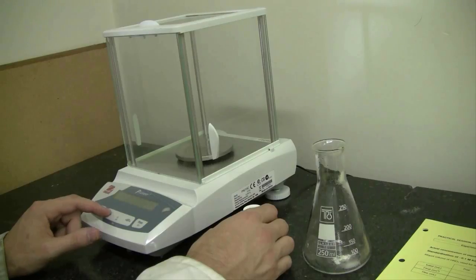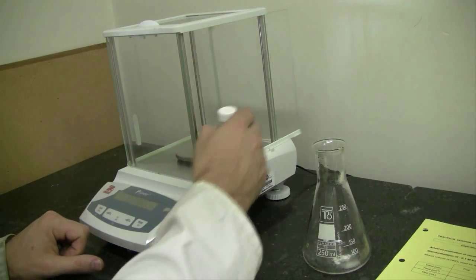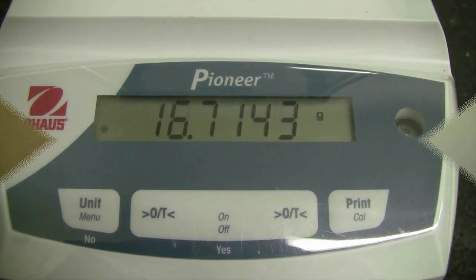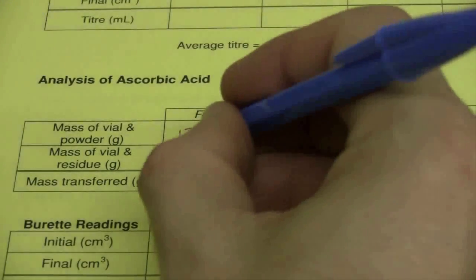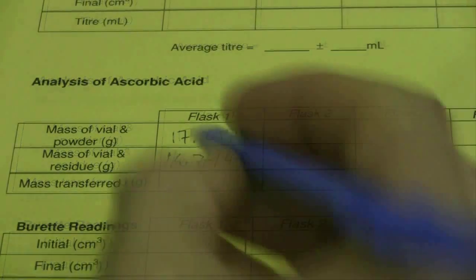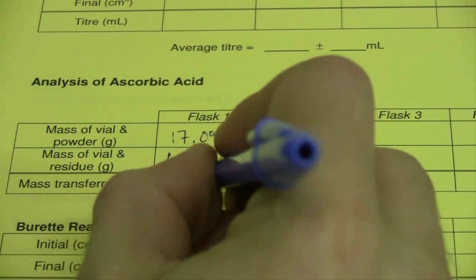Zero the balance with the doors shut, place your sample back in the analytical balance, and record another mass to four decimal places. You can record that directly on your result sheet and then determine the exact mass that you've transferred to your conical flask by calculating the difference between these two masses.